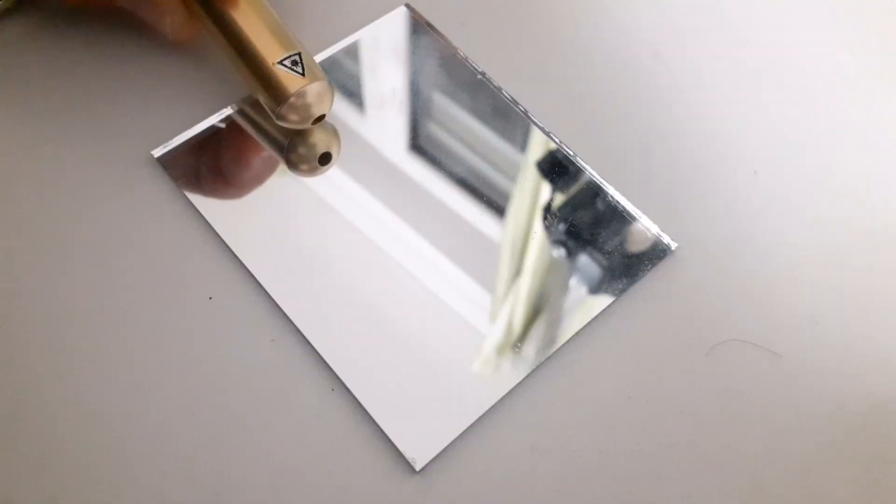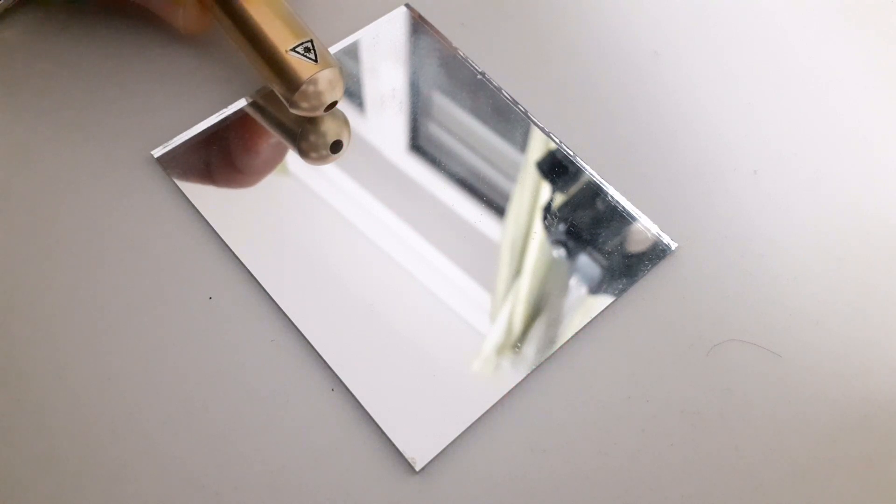And that's, of course, something that you don't want. Now let's do another little experiment here. I'm using a very shallow angle to use the laser pointer to reflect it on the mirror surface. And on the wall, what I can see is it's not a clear dot, but I can actually see that there are so-called diffraction lines on the bottom.